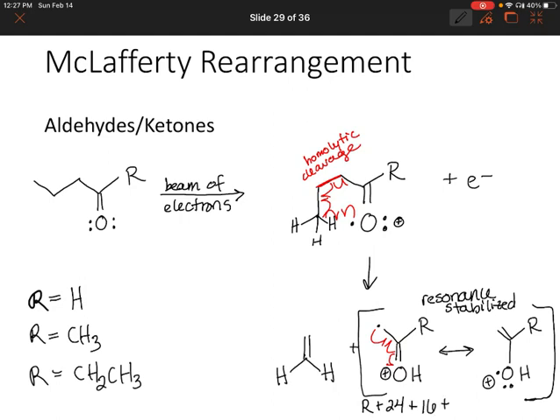And we actually have 3 hydrogens, 1 on the oxygen, and then there's 2 hydrogens on the end. So that's a total of 3. And I'm just kind of rounding the masses here. So let's see, 24 plus 16, that would give us 40. And then plus 3, that gives us a mass of 43.